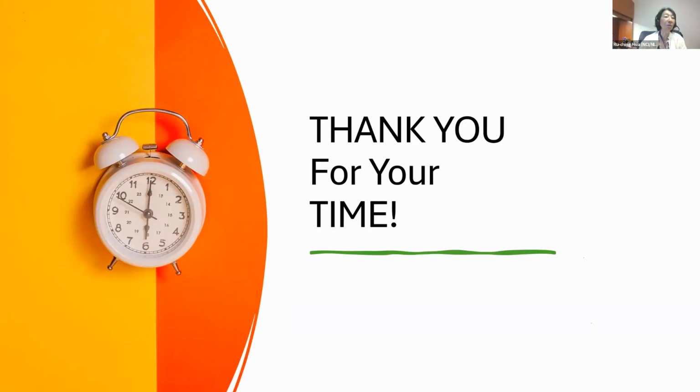So does anyone have any questions? Is there anything in the chat? Okay, Louis, could you just ask the question directly? Sure, thank you. Very nice talk. I appreciate it. Two short questions, hopefully. Could you say what the glue was that you used to adhere them in the cryo conditions? And secondarily, it would seem like when you transfer from the liquid nitrogen to the SEM, you're going to get a lot of frost condensation on the surface. How do you eliminate that? Thank you.